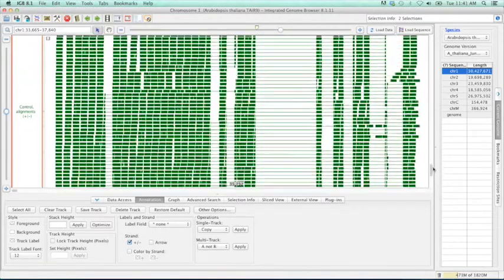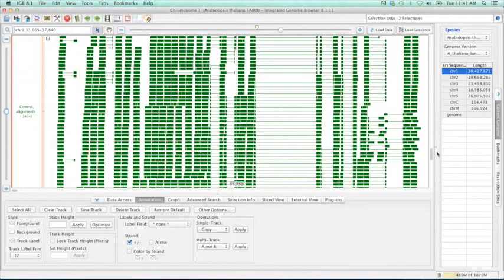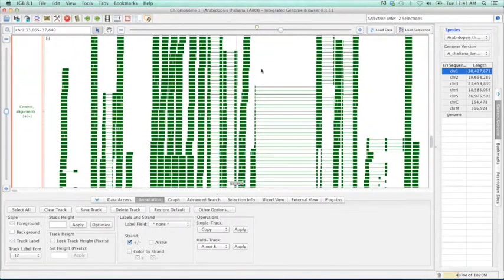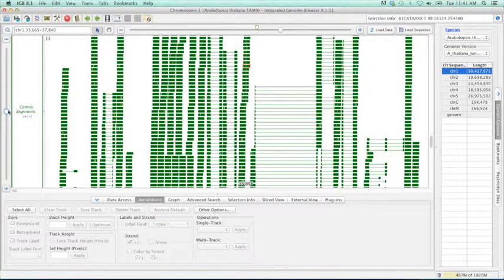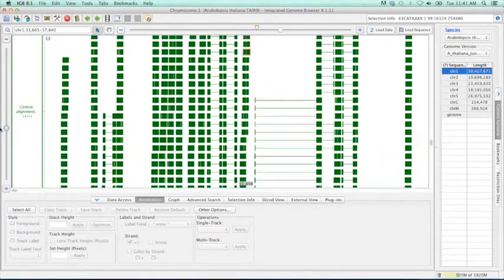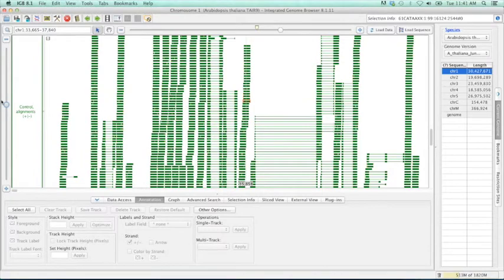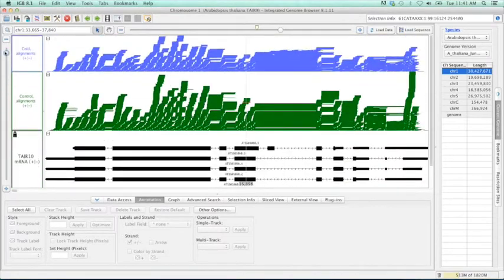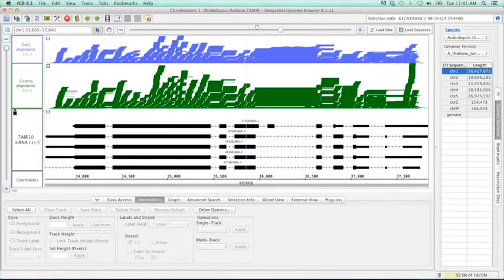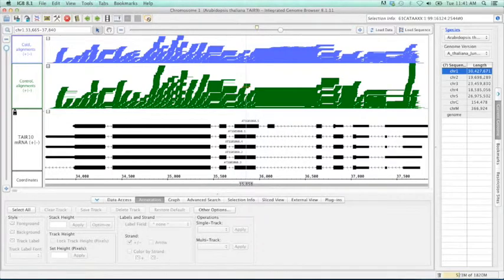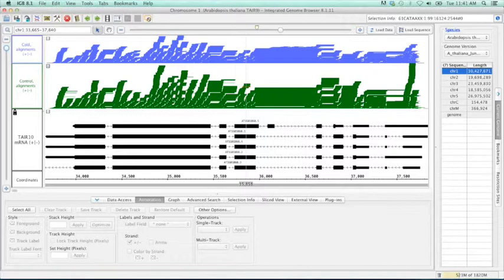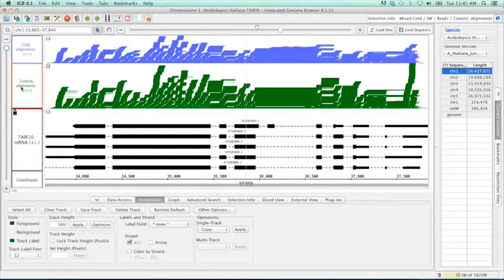Of course, this is a lot of data, and it's a little hard to visualize, though it does a very good job of zooming in so we can expand these regions more or less. But IGBI offers several other functions which should make this even easier to look at and analyze. What we really want is a way to visualize and quantify the number of reads which occur at junctions, allowing us to better visualize what alternative splicing is occurring. To do this, we can use the junction track feature.